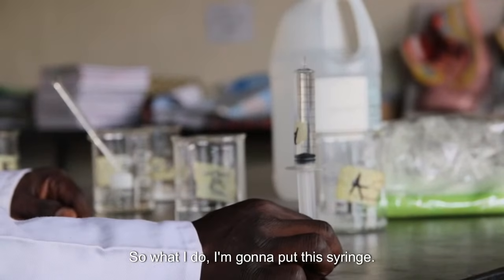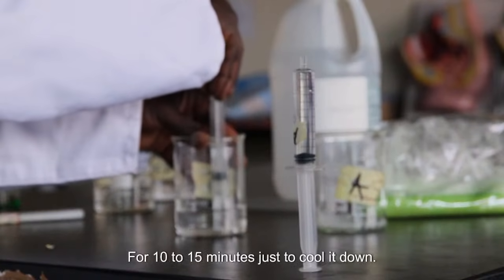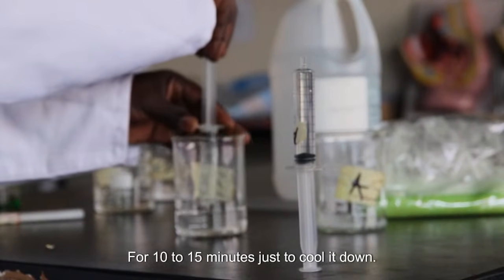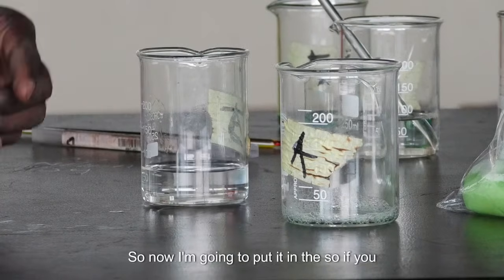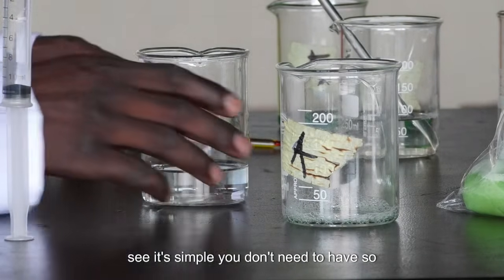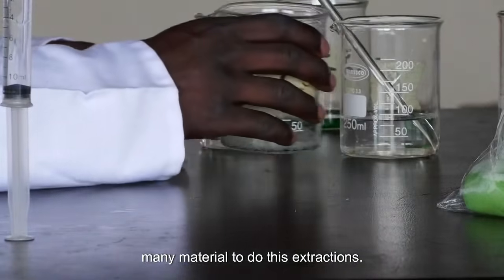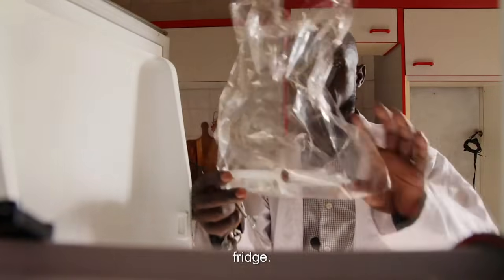I'm going to put this syringe in the fridge for 10 to 15 minutes just to cool it down. So you see it's simple. You don't need to have so many materials to do these extractions. So now let's go to the fridge and we put this in the fridge.